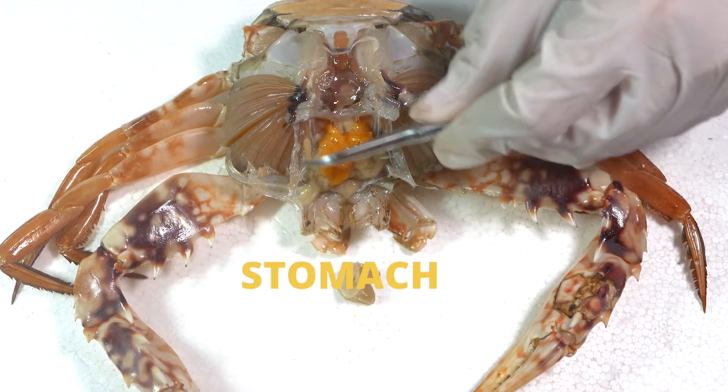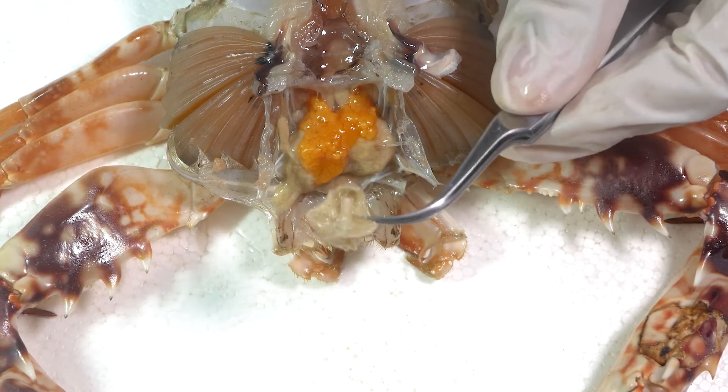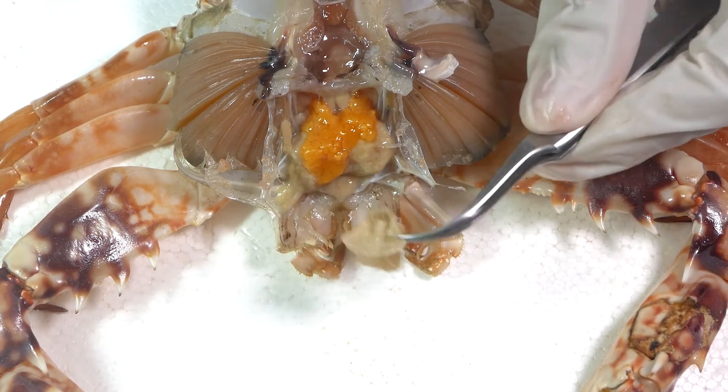The whole region up here is the stomach of the crab. It is a large, oval, muscular sac just beneath the gastric region of the carapace.